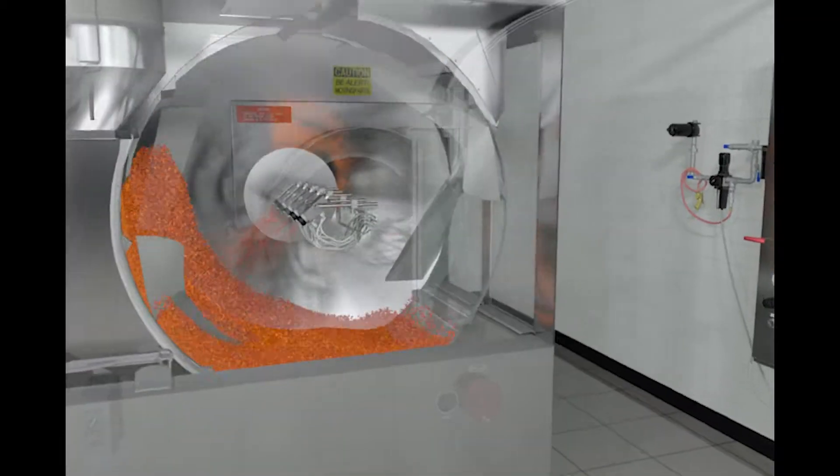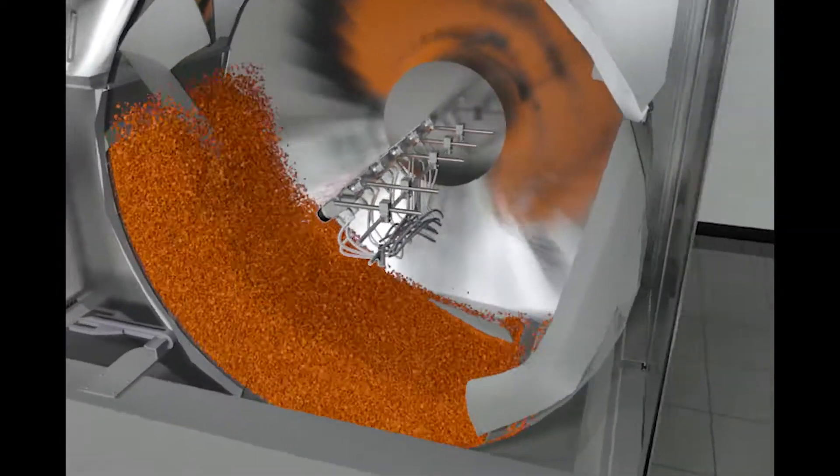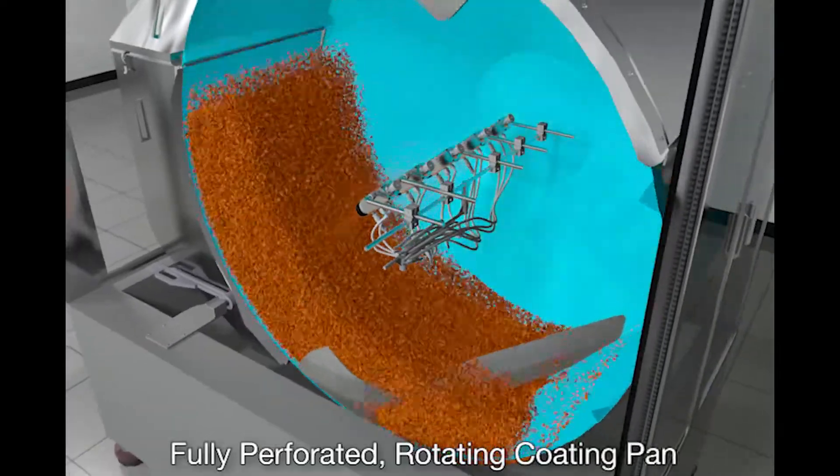Tablet coating takes place in a controlled atmosphere inside a fully perforated, rotating coating pan.